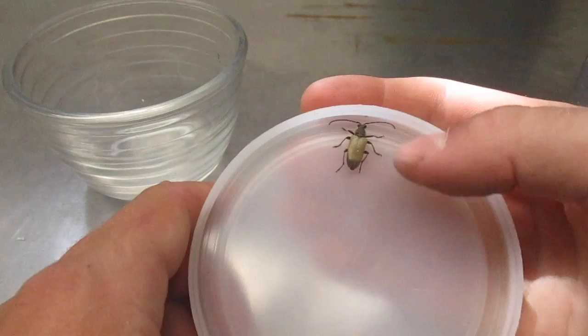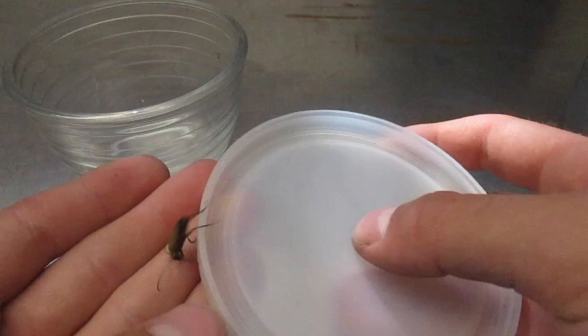Today I'm going to show you how to euthanize insects for your collection. Right here I've got this longhorn beetle that I'm going to euthanize and add to my collection.